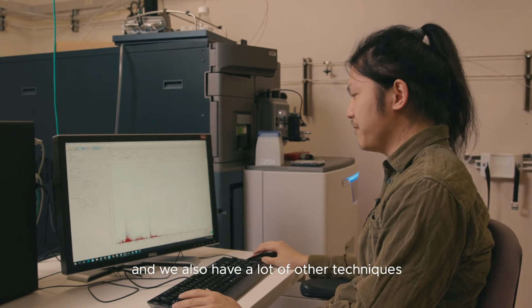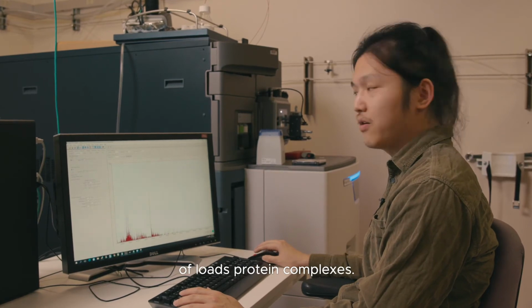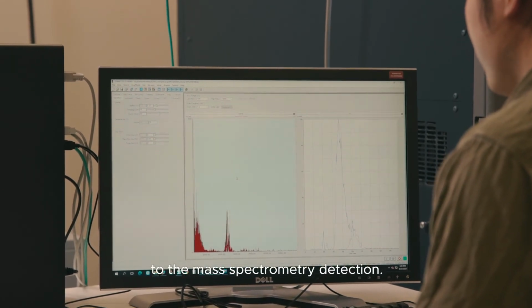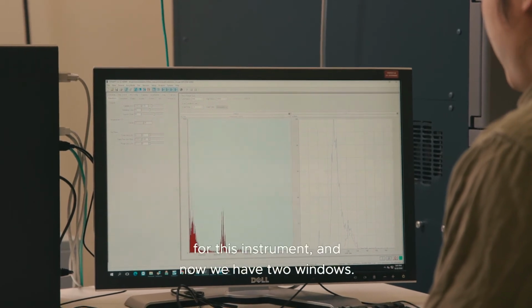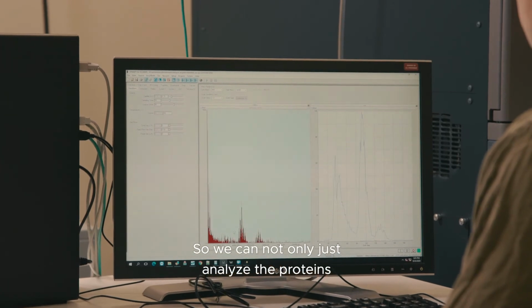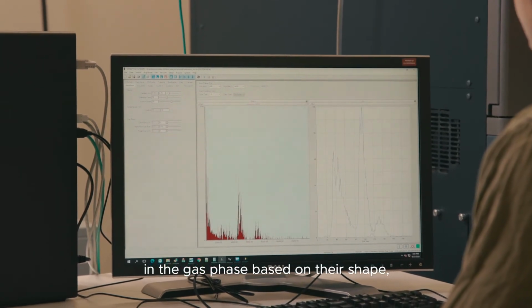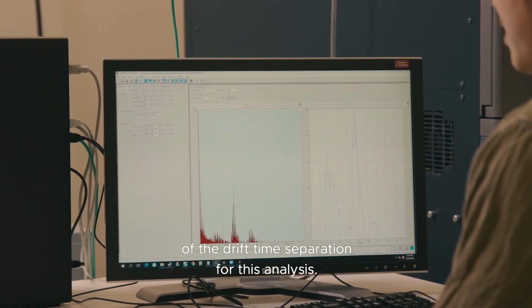And we also have a lot of other techniques we can use to get further structural information of those protein complexes. So we also have the function of ion mobility separation in parallel to the mass spectrometry detection. I just activated the ion mobility mode for this instrument, and now we have two windows. So we can not only analyze the proteins by their mass-to-charge, but we can also separate the proteins in the gas phase based on their shape. And that gives us this extra dimension of drift time separation for this analysis.